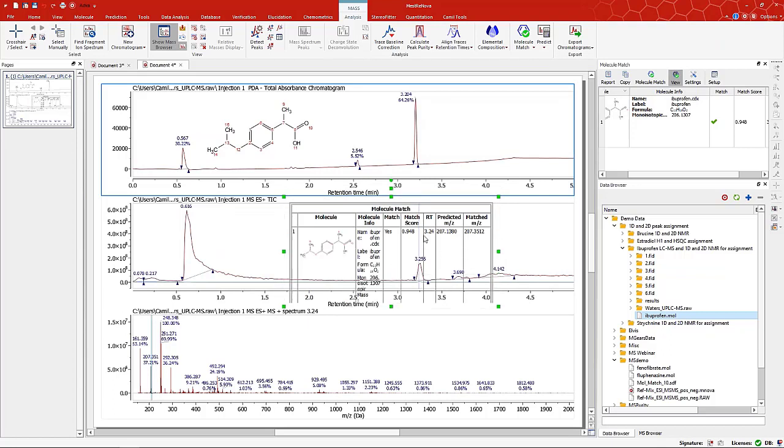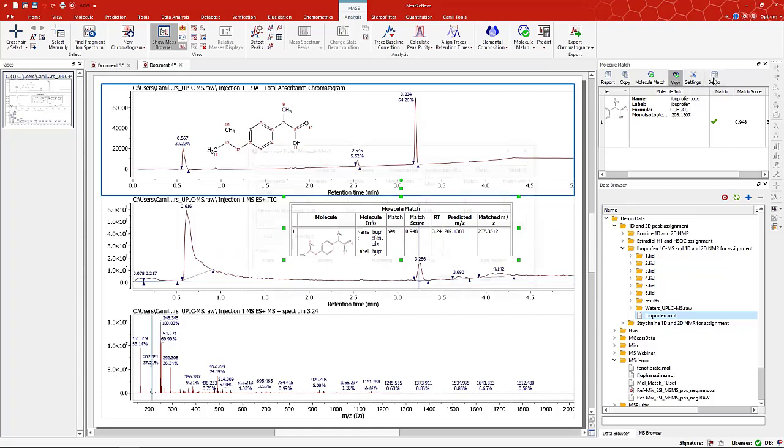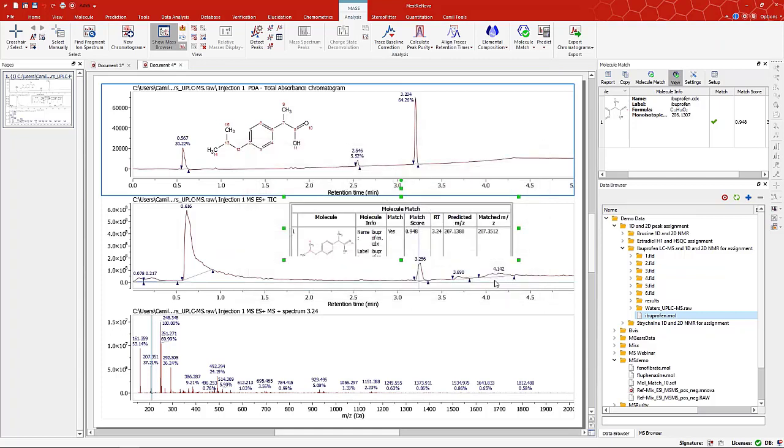Let me make it a little wider. Oh, it's not doing so good there. I can adjust it, and notice that the borders here are double borders. That's everything. You can set all that up here, down here with the frame and so forth. So you can manipulate that.